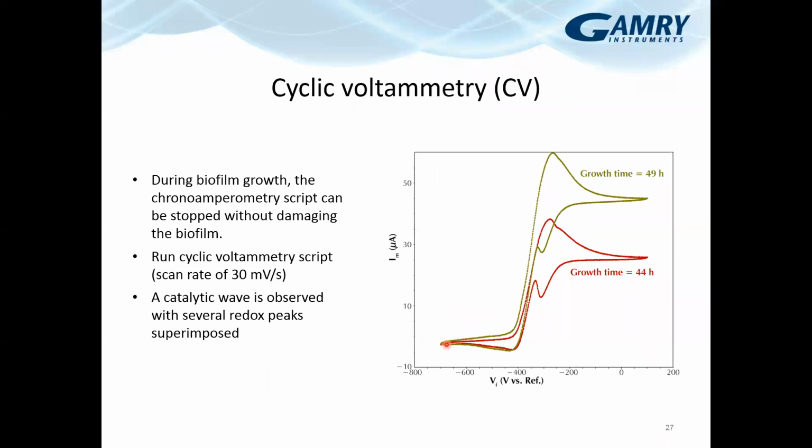This is a typical CV analysis in biofilm electrochemistry, where you can measure the onset or activation of that half reaction, metabolizing acetate to protons, electrons and CO2. From the start you'll see no current or baseline current, then all of a sudden an increase and a ramp, and then a decrease, right? And this is essentially a catalytic wave.